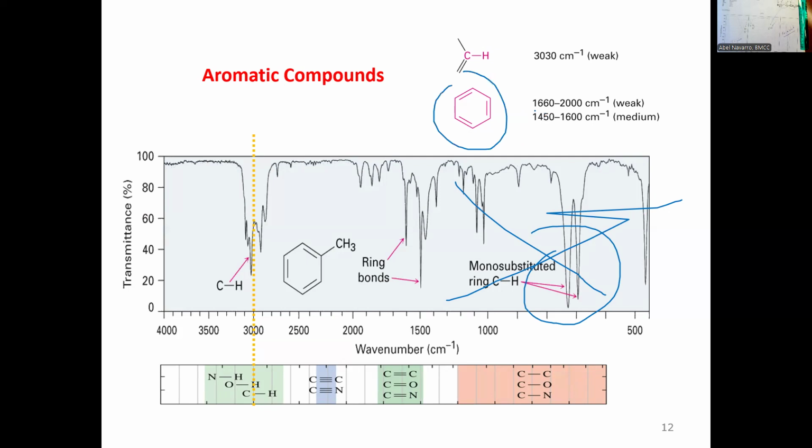So that is what it's telling you about the aromatic, right? Aromatic, you guys will see one small or weak peak between 1660 and 2000 and another medium between that range, right? But once again, those numbers change, but you are supposed to see two needles like this one and this one. I'm sorry, this spikes when I use my mouse. Okay, so those two peaks are the aromatic. That is the CHSP2. They forgot here the label, CHSP2, and this one should be CHSP3, right?